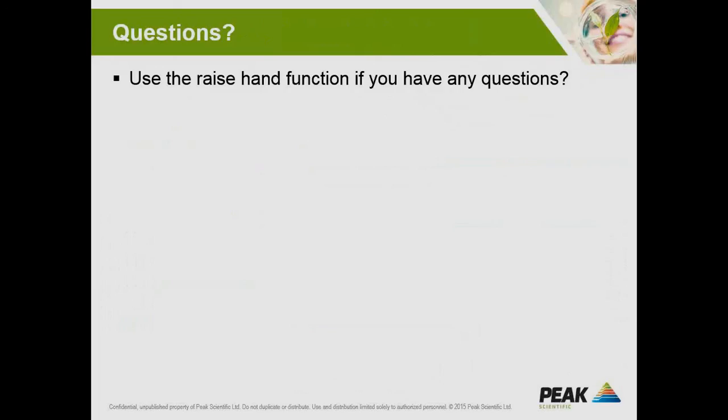Thank you. And I think Mr. Praveen Dixit has 2 questions here. He's asked about how do you calibrate or qualify the gas generator, and also how do you test the generated gas. So I'll just unmute Mr. Praveen so that you can interact with him. Just give me a second, please. Okay. Yeah, Mr. Praveen, please. I unmuted you. Hello? Hello? Yes, Mr. Praveen. No, I can't hear him. No. Okay, so the questions are, how do you calibrate or qualify the gas generator? And how do you test the generated gas?